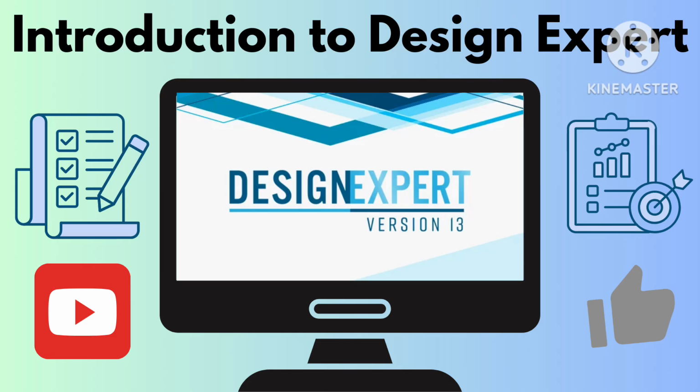Hey everyone, welcome to this video on Design Expert, a powerful tool used in pharmaceutical research and formulation development. If you are a pharmacy student working on formulation, drug delivery or quality by design, then this software will help you to optimize your experiments efficiently.